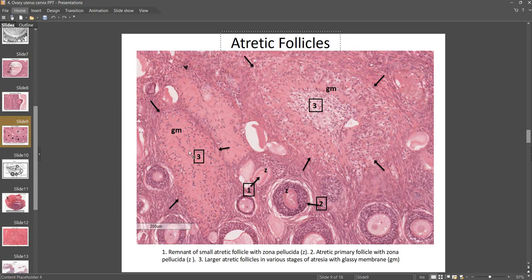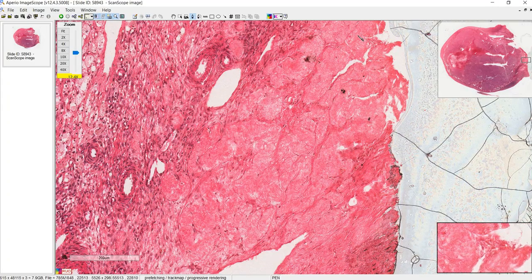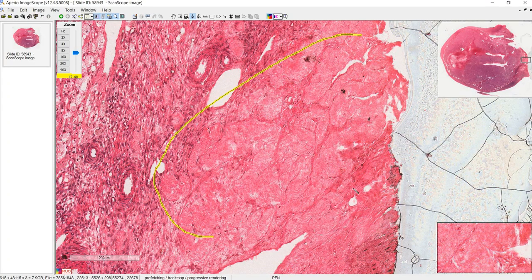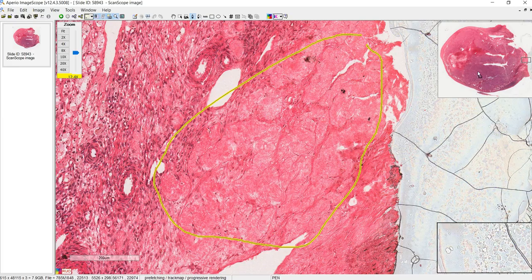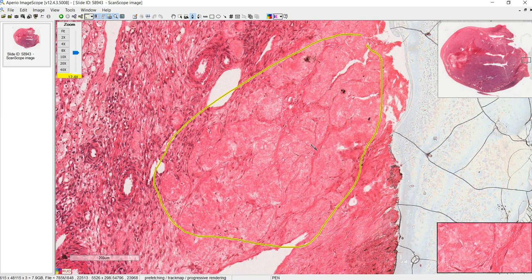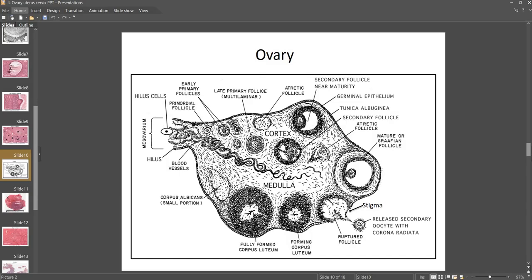The corpus albicans is completely different even though it might look similar. The atretic follicles are follicles that didn't make it to ovulation, but the corpus albicans is the degenerated remnant of the corpus luteum when there is no fertilization — so this is from a follicle that at some point had ovulated.